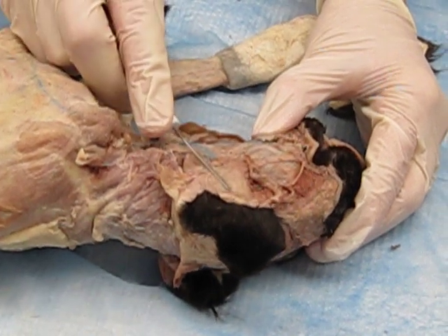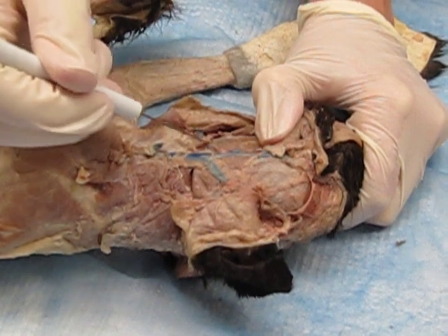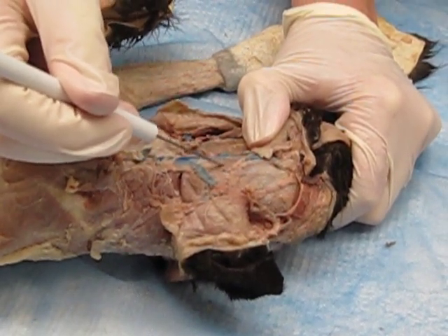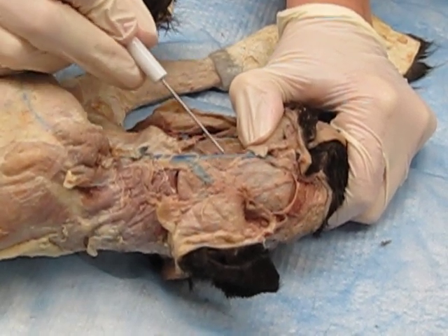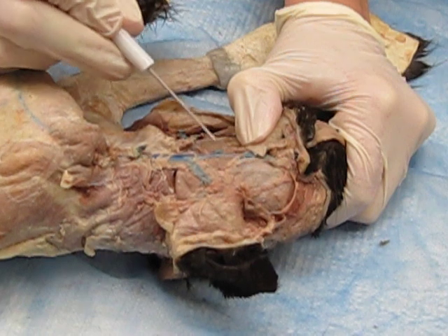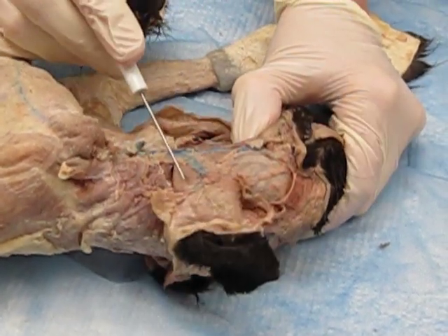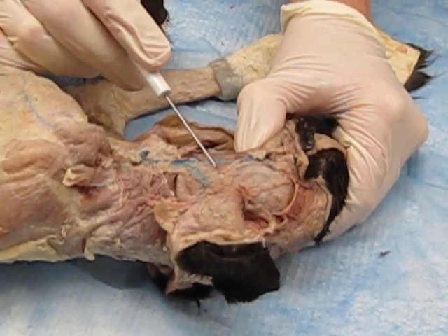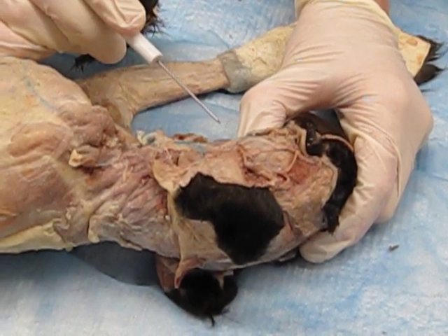So parotid salivary gland, mandibular salivary gland. Up along this linguofacial vein is the mandibular lymph nodes, and they pair on each side of the vessel. You see that? Okay. So once again, the glands: parotid salivary gland, mandibular salivary gland, mandibular lymph nodes. Okay? I want you to start with those structures. Those are the ones you need to find first.